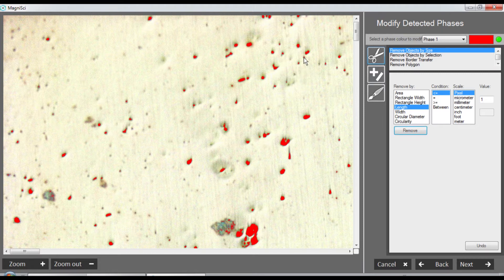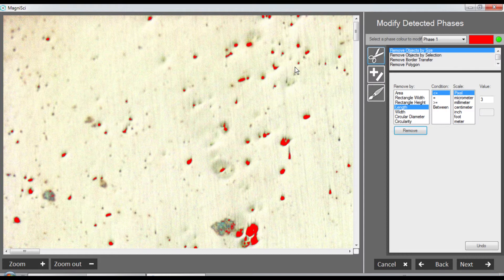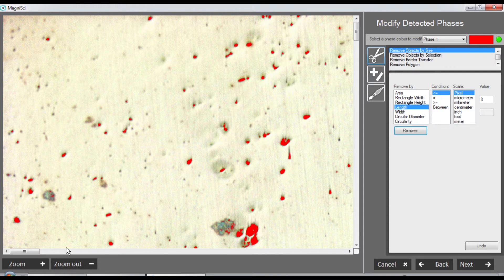It's really your judgment whether you want to measure particles below basically three pixels in length - that is not accurate for measurement, because if something is just three pixels in diameter the measurement wouldn't be accurate. So in this case we remove those objects because their diameter would not be accurate if they're only three pixels. You need a substantial number of pixels forming an object.